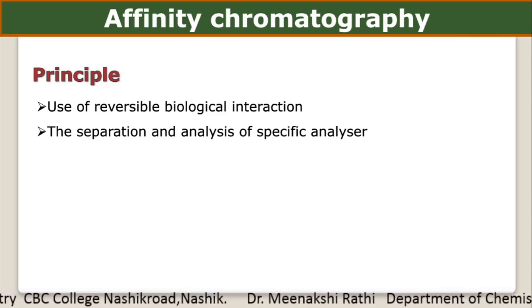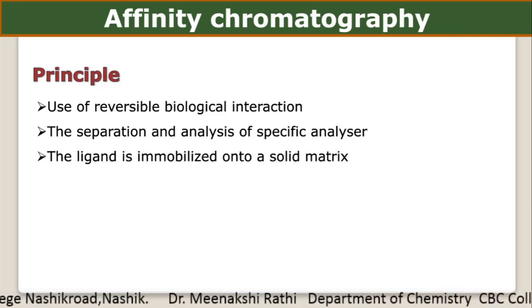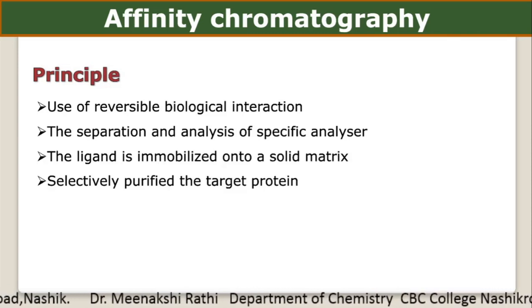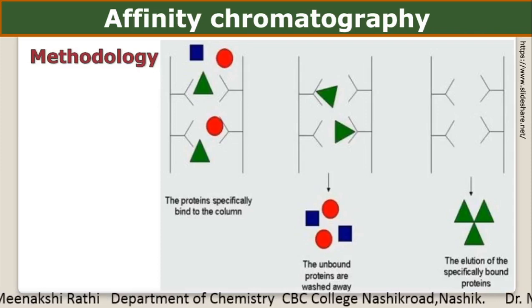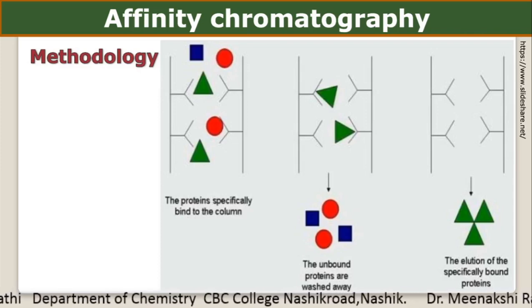For example, by using affinity chromatography, we can separate enzymes with an inhibitor and antigen with an antibody. Now here you can see the technique which is used.